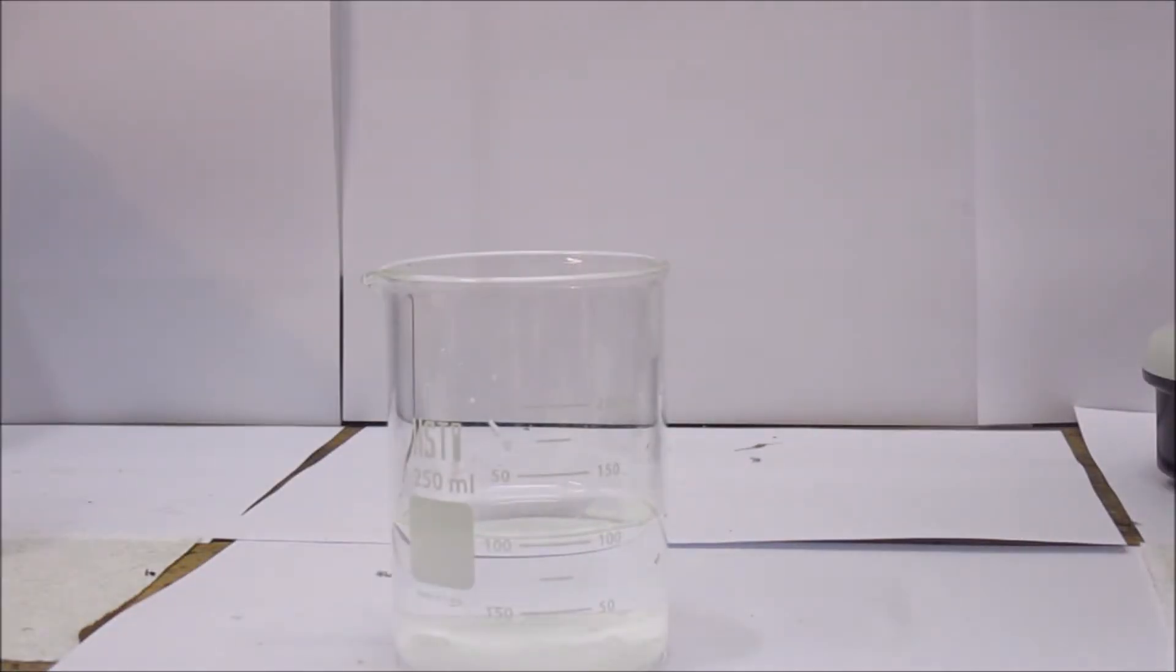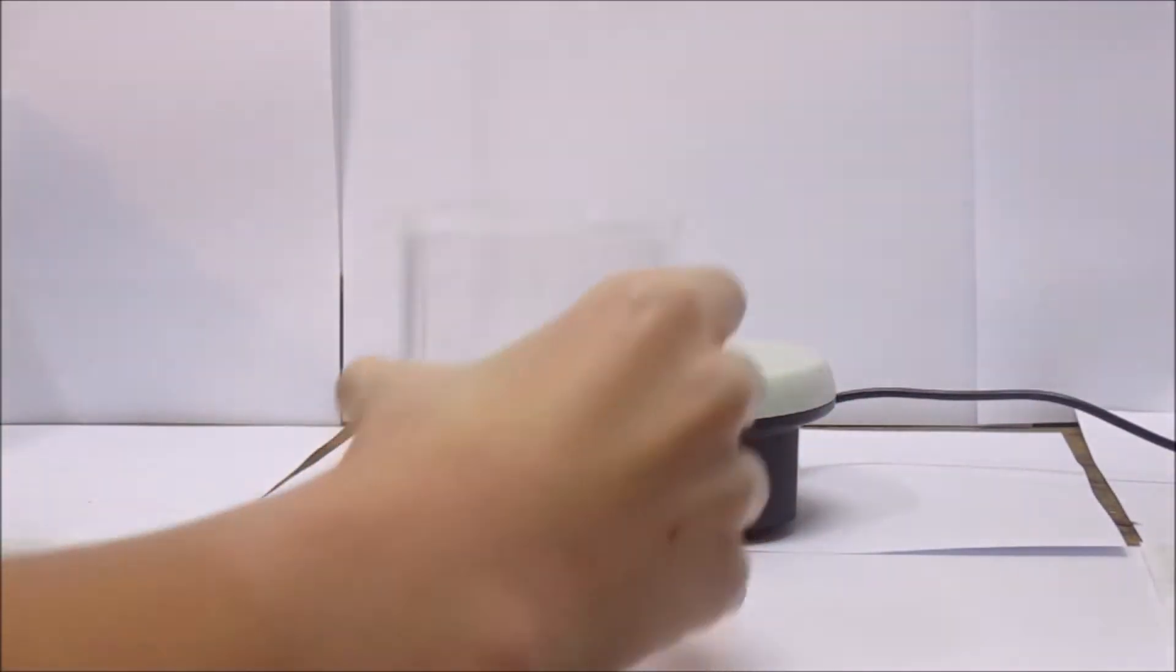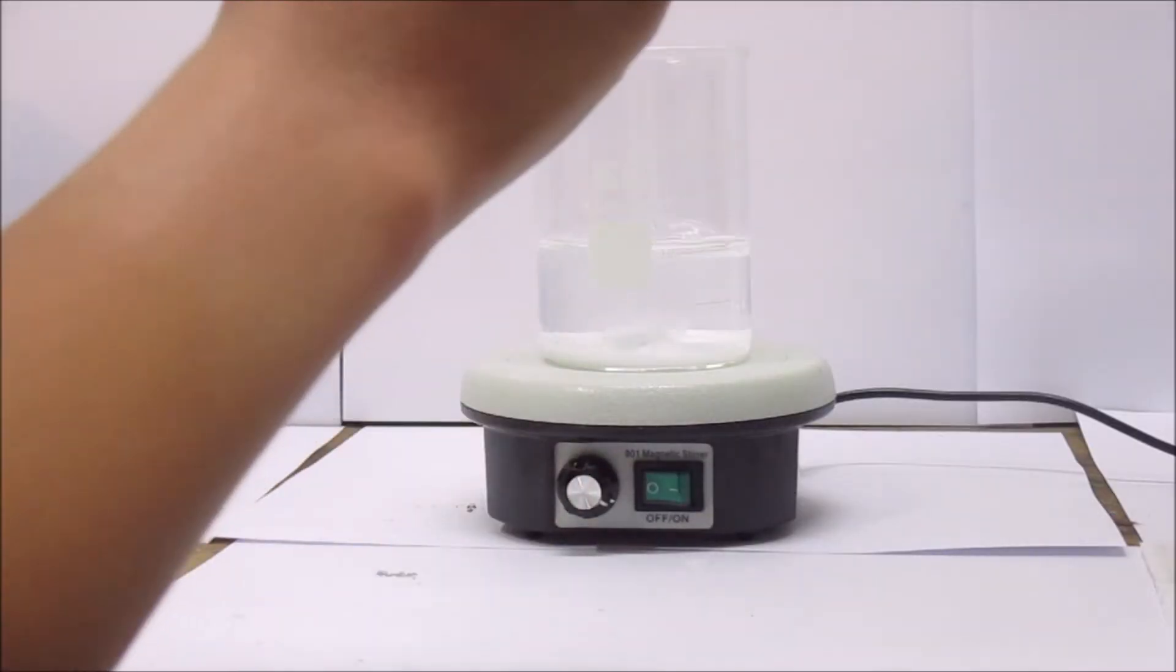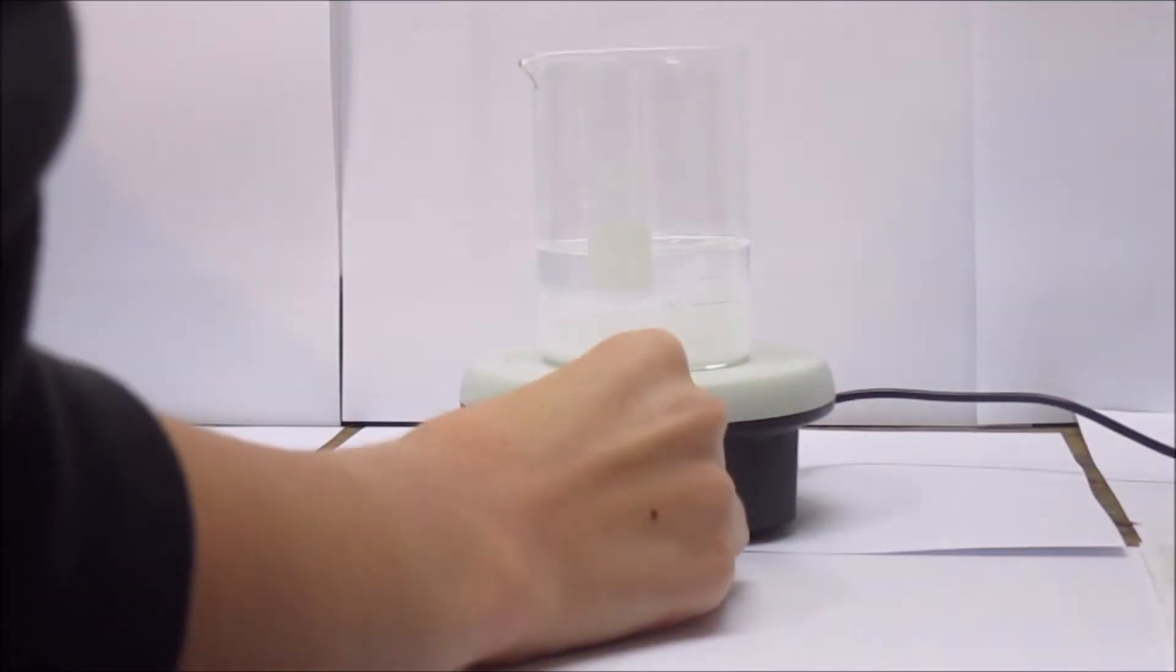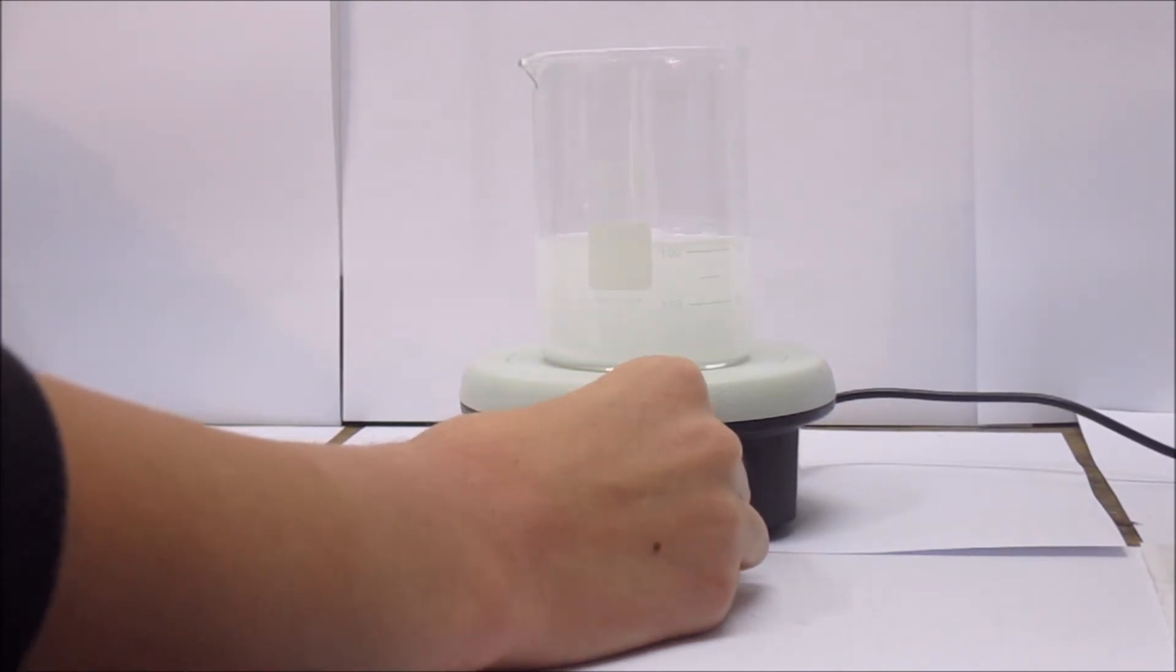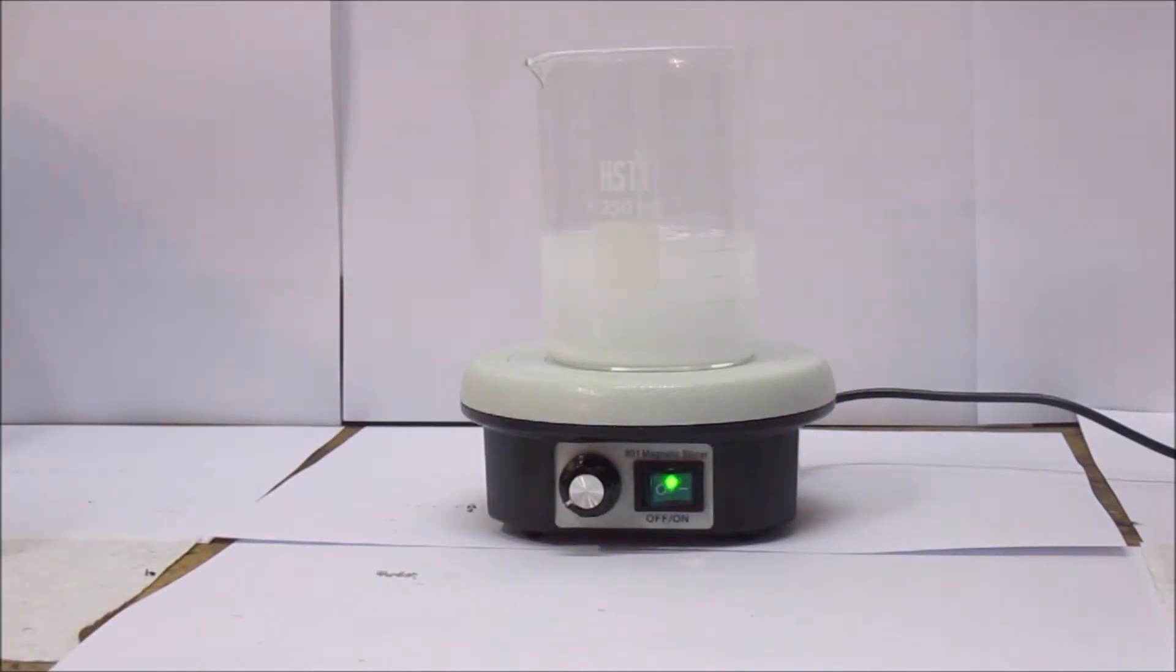And then I placed it on the magnetic stir plate. I then added a stir bar, turned it on, and let it dissolve. Once it was done, I took it off the stir plate.